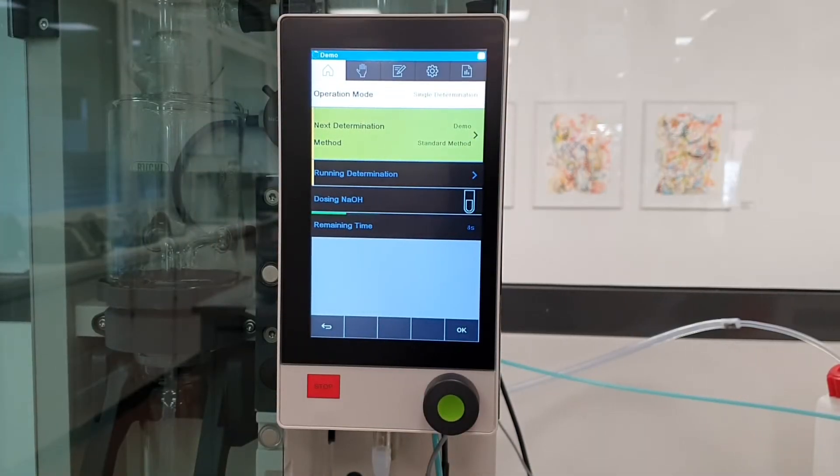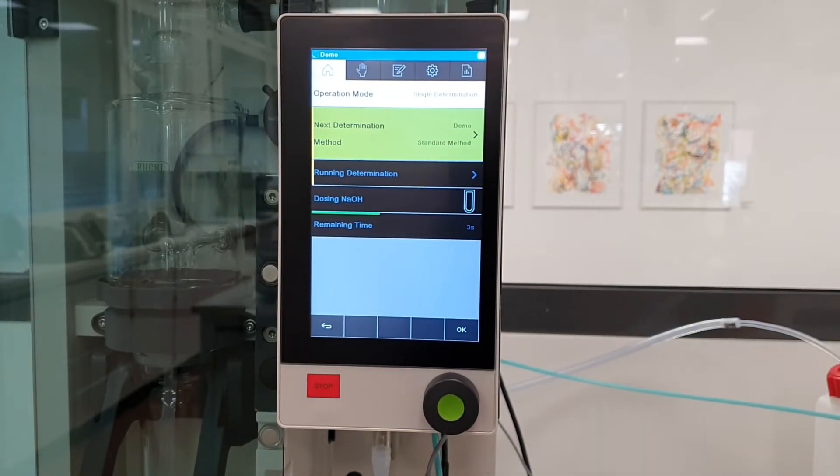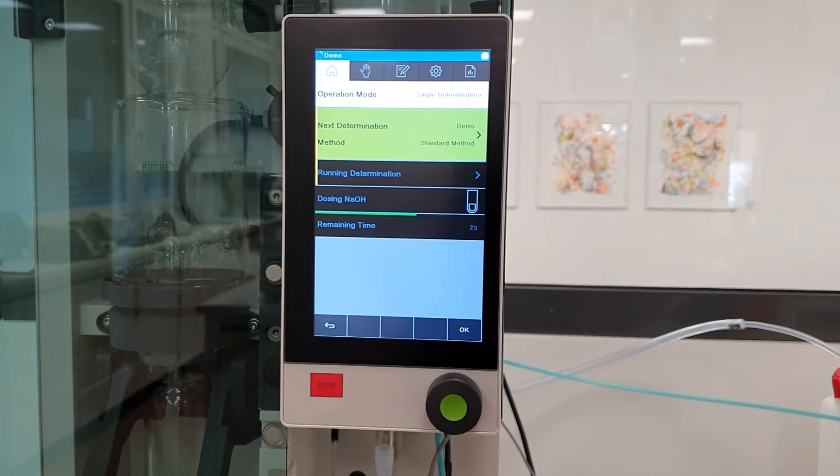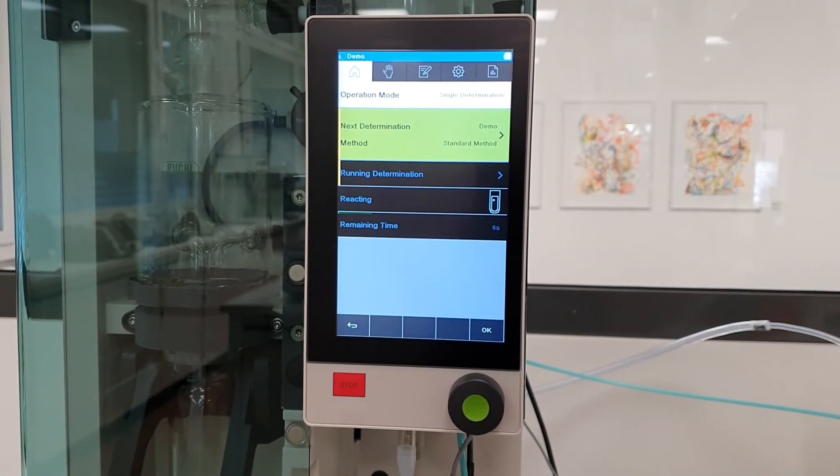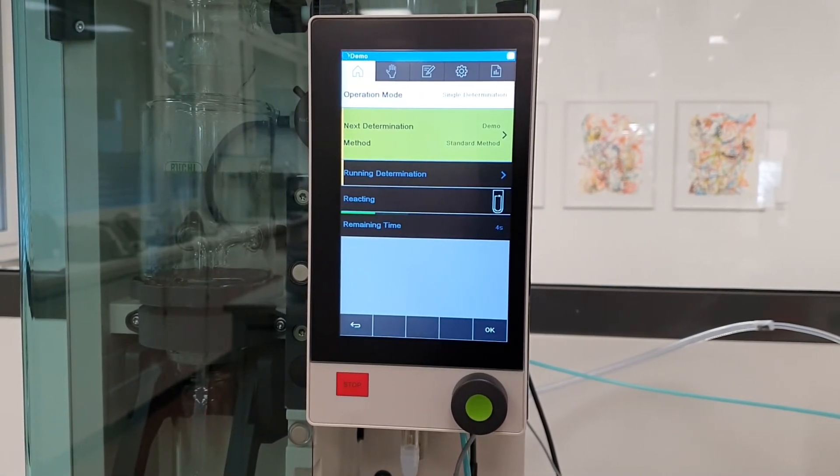The cooling water flow sensor detects if there is no cooling water flow and a warning shows up on the screen.